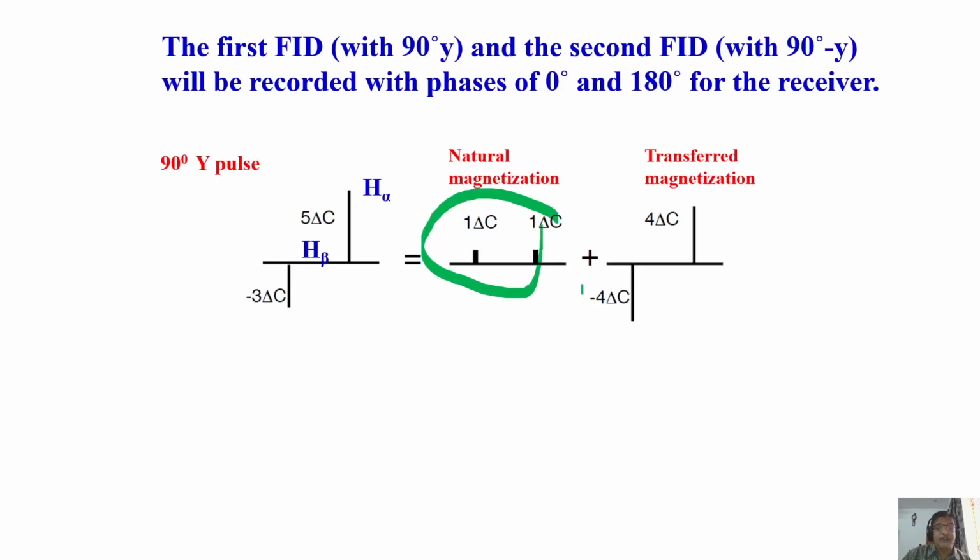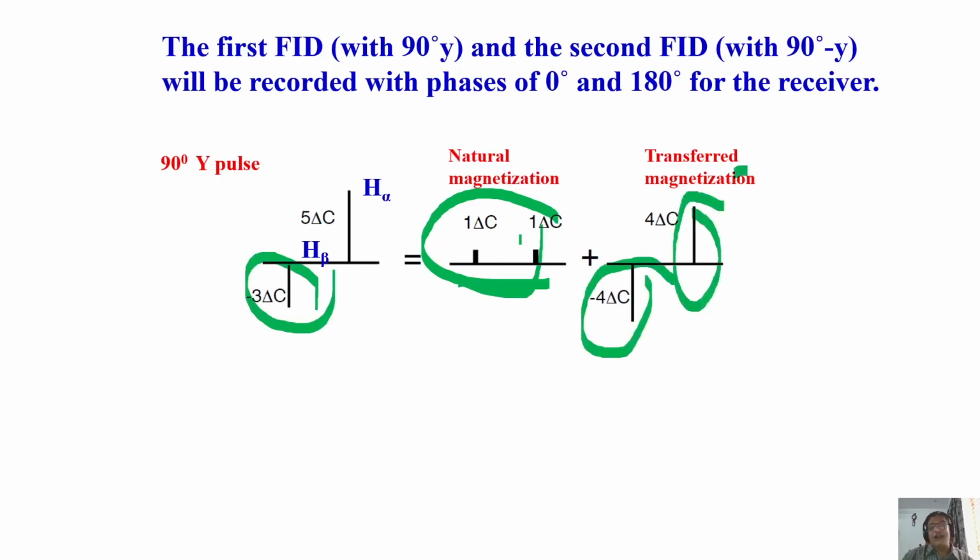This is one intensity, this is +5. This adds up as a component because this is all in phase. The natural signal magnetization of carbon is in phase, but they are in antiphase. Now what is going to happen? This will add. Now if this is present, finally the transferred magnetization turns out to be 4 and this gets subtracted, it will become -4, because natural magnetization is adding for that, and it is creating some trouble for us. Okay. So this is even a worse situation. At this place, if you do the decoupling, you will get completely zero signal.